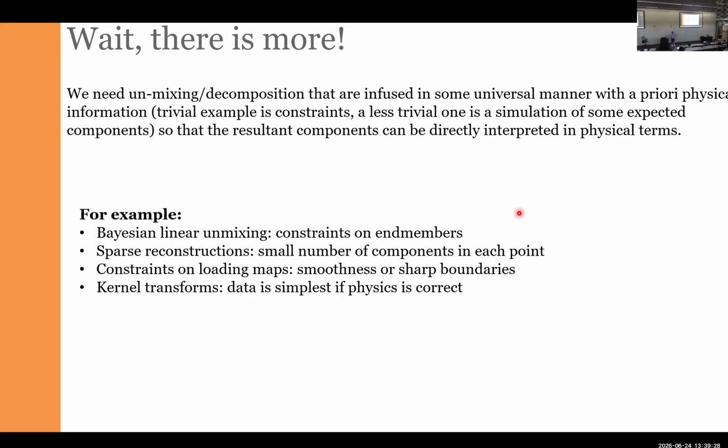If you want to learn how to use these things, there is no other way but to go to scikit-learn and go through these functions one-to-one, either by yourself with Read the Docs or with ChatGPT. The idea is to understand the physical principles behind this type of analytics. Don't worry about programming. By now, it can be taken care of by the LLMs. Don't worry about the data volumes or whatever, because unless you start to work with some ginormous data sets, we have more than enough computational resources to do that.